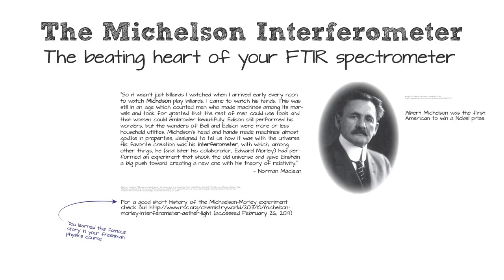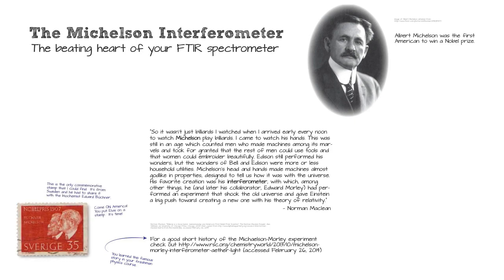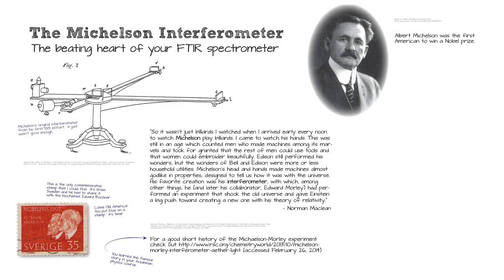And so when Michelson was developing his interferometer, his first attempt was to create a device in Germany, and despite having access to all of German craftsmanship, he was not able to create a device that was stable enough to give him results that were good enough to prove the point he was trying to make, that the speed of light would be different in two directions because of the fact that it traveled through a mysterious fluid called the ether.